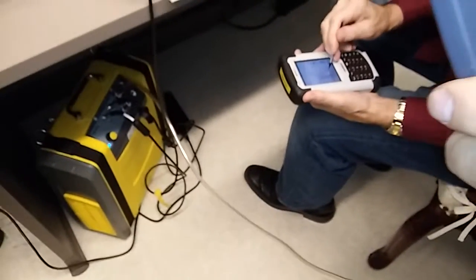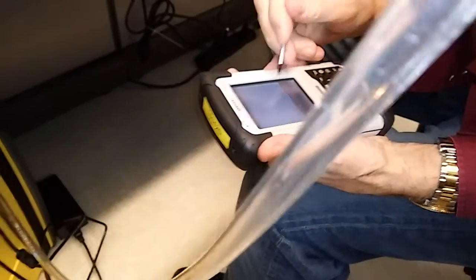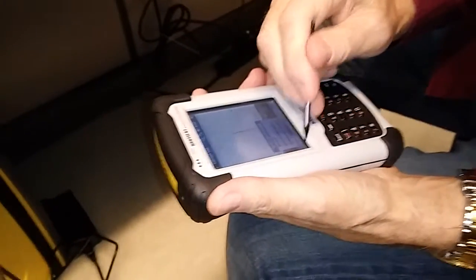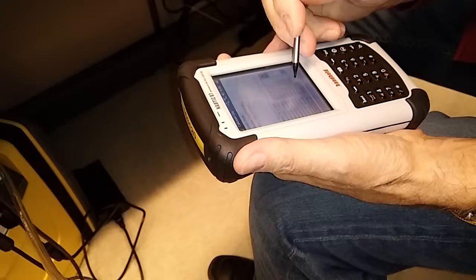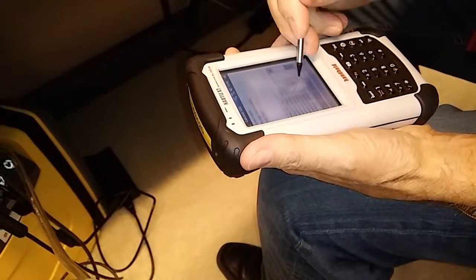Wow, this one says 0950. That's when it started. So let's look and open a file. Okay. But it's not giving me what I wanted. It should open the spectrum, but it's not giving me what I want.